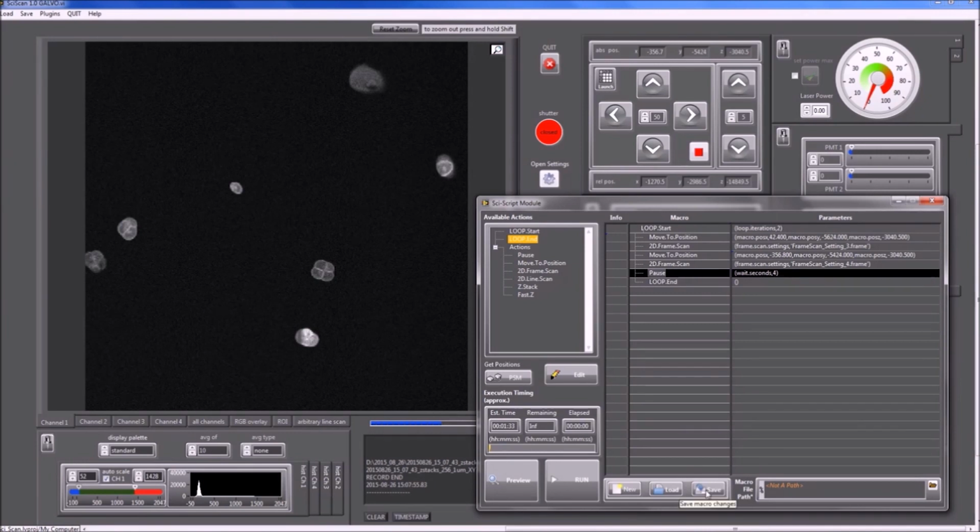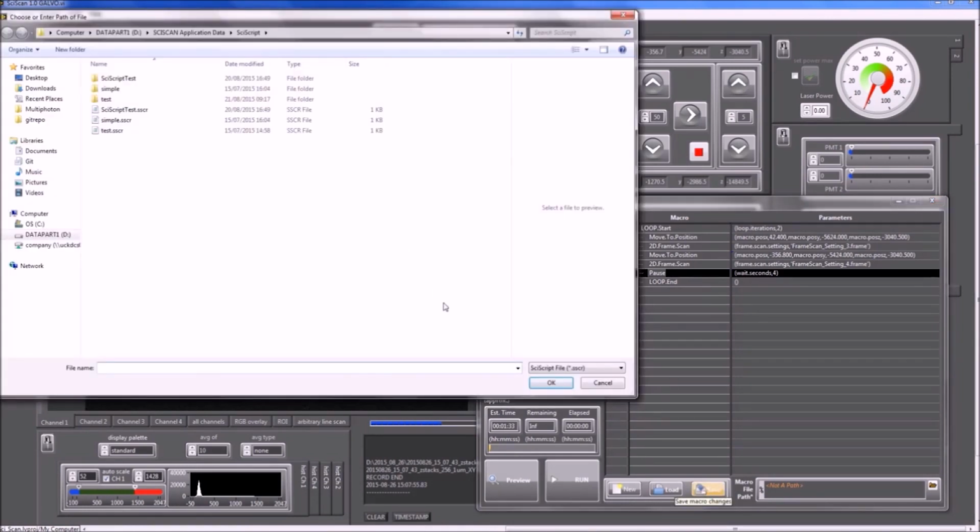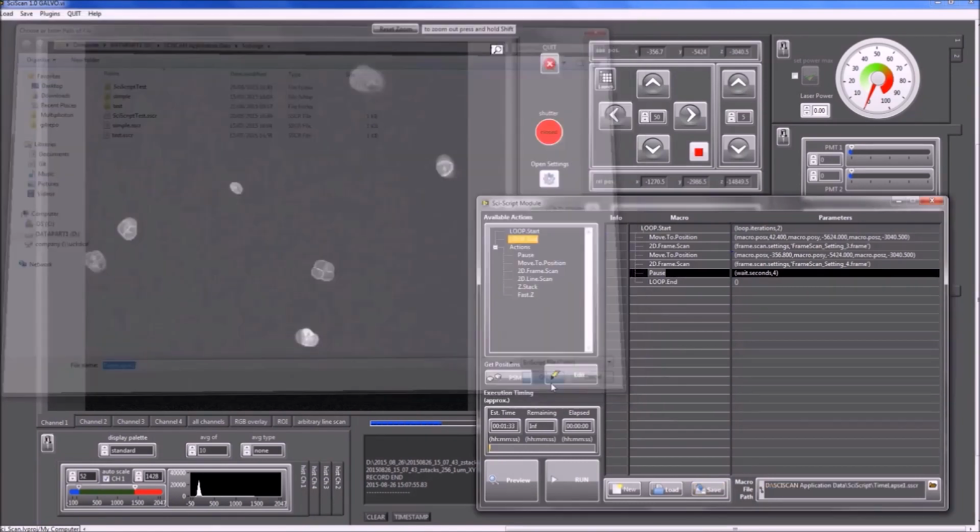Next, we'll see how we'll save this macro to a file. Below we have the file IO cluster, which has an option called save. You can find out that the current file is unsaved because of the star in the path, and then there's a red coloration as well to indicate that. If I click on that, I get the file browser where I can specify the location and the name to which I want to save the macro file. So I'll just enter the name and press OK.